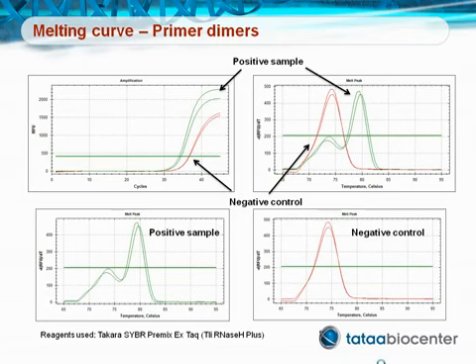If running a dye-based assay, the primer dimers can be identified by running a melting curve after the PCR run. The melting temperatures of the DNA products in the tubes will then be revealed, and different products can be identified. The primer dimers are often rather short and will thus have a low melting temperature compared to the longer specific product from the positive PCR run.